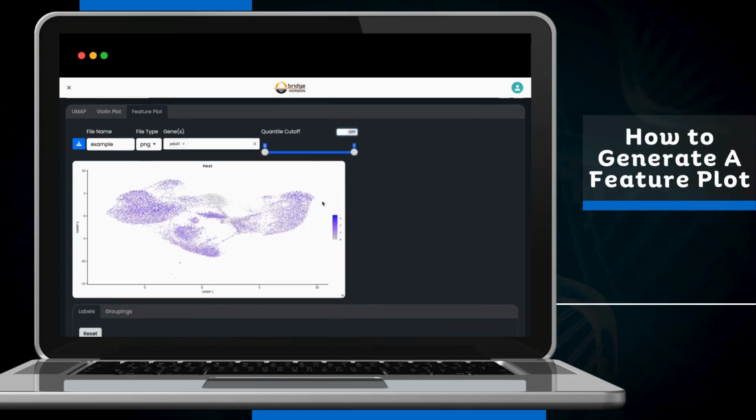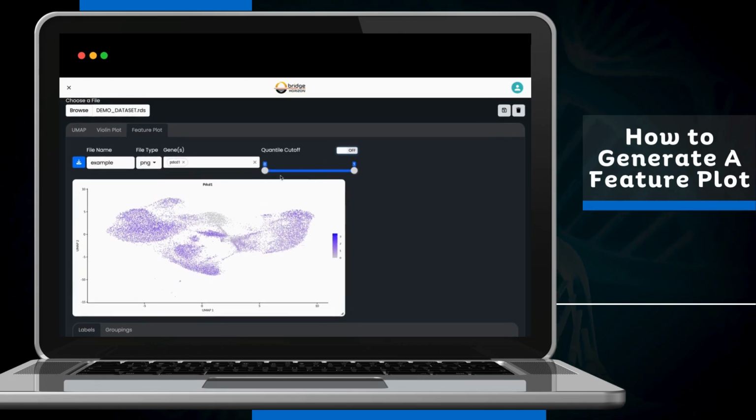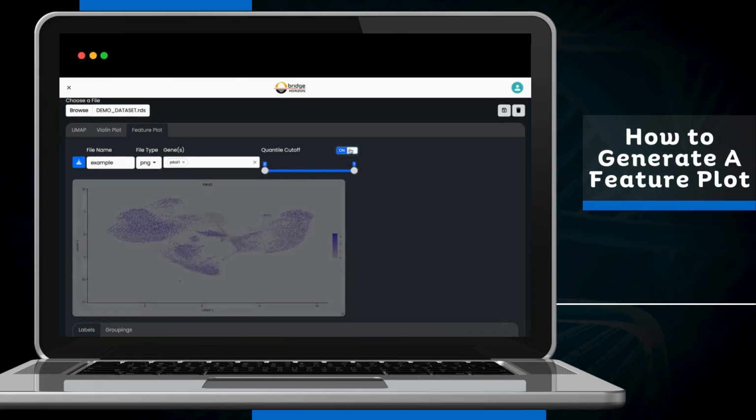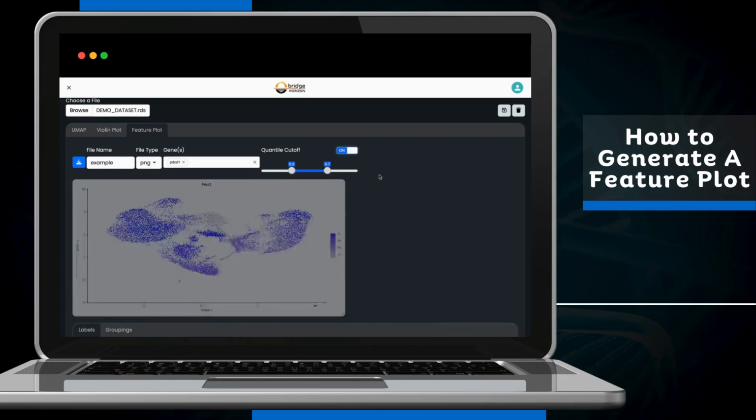Now, one cool feature in feature plot is you have the ability to adjust the quantile cutoffs. Currently, they're set to off. You can turn them on by toggling this switch from off to on position. And at this point, you have the ability to adjust your quantile cutoffs within the feature plot.